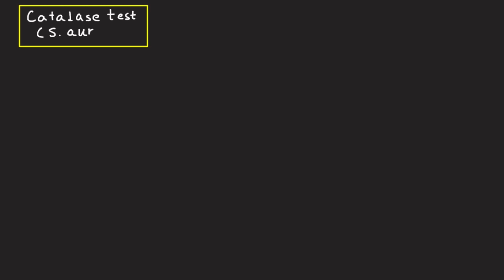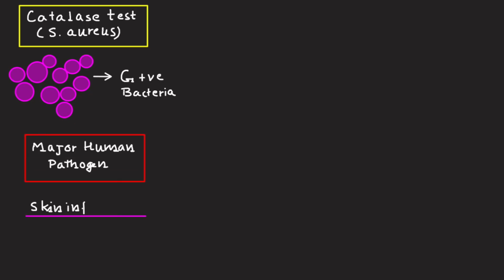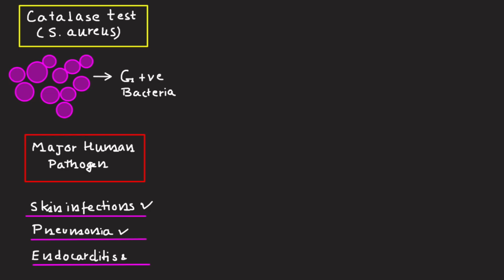Let's discuss the catalase test for Staphylococcus aureus. Staphylococcus aureus is a gram-positive bacterium that is a major human pathogen and that causes various infections, from mild skin infections to life-threatening conditions such as pneumonia, endocarditis, and sepsis.